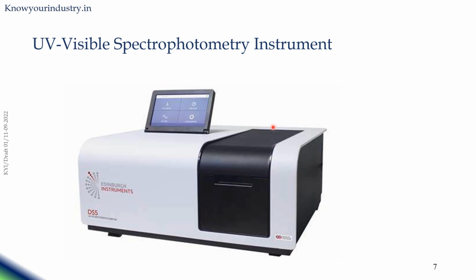If you remove the door, you will find a place to keep the cuvettes or sample cells through which the light will be passed. And then you can see the readings on this monitor, which is kept above the instrument, and you can note down the reading and do the calculations further.